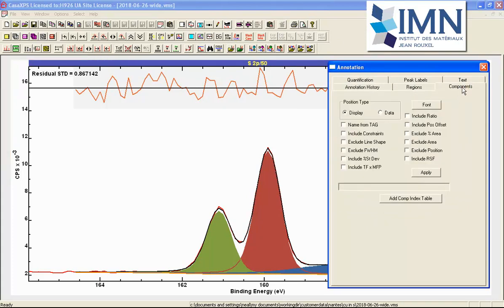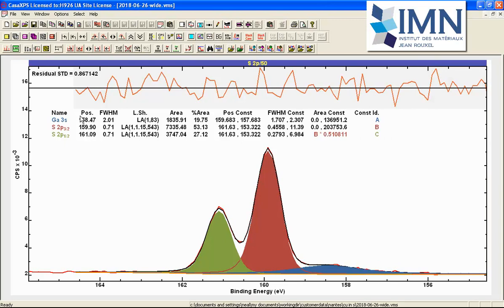Going to the components property page on the annotation dialog window, there are a set of options to include or exclude different items. I am going to include all of these line shapes, full width half maxima, area, etc. by not ticking the boxes, since ticked boxes indicate that parameters should be excluded from the table. I need to specifically ask to include constraints. When I include constraints and press apply, I end up with a table illustrating the three components — Gallium and two for sulfur. We can see the position, area, and full width half maximum for each one, as well as the line shapes, which differ between the Gallium and the sulfur. Both line shapes are identical for the sulfur 3/2 and 1/2 peaks, and the full width half maximum is identical for both of these.